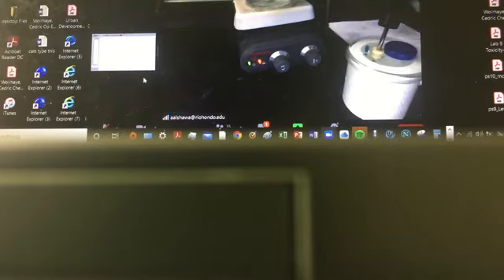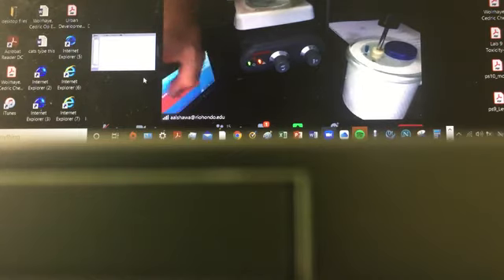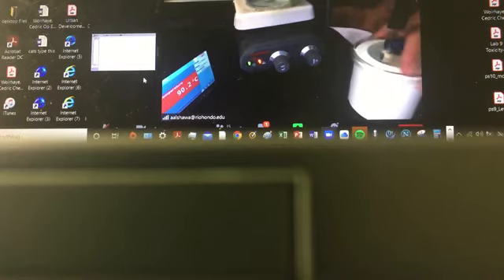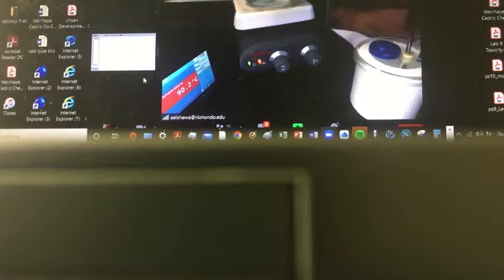If there's no chance to deliver a hotter temperature than 90, I'm going to just stick with 90. So let's monitor that at 90.2. Let's see how stable it's going to be.